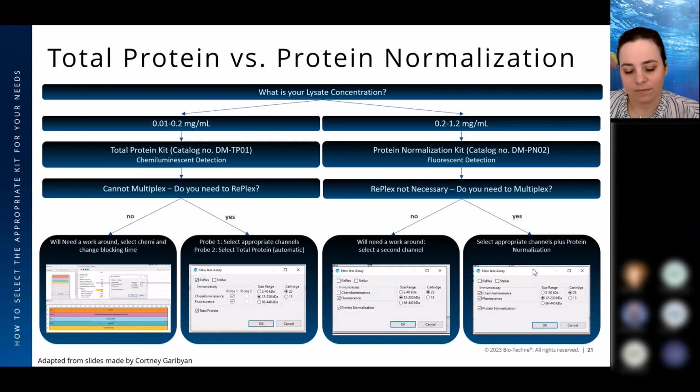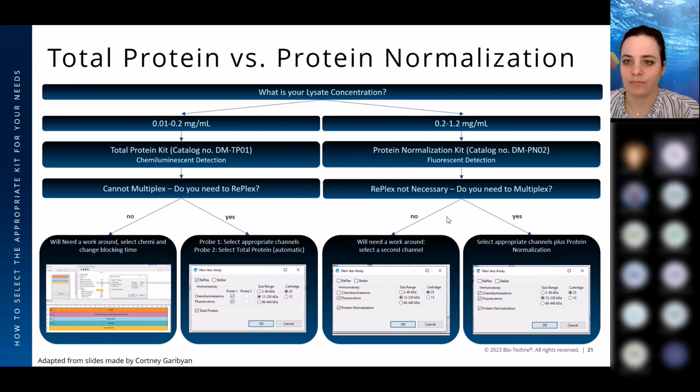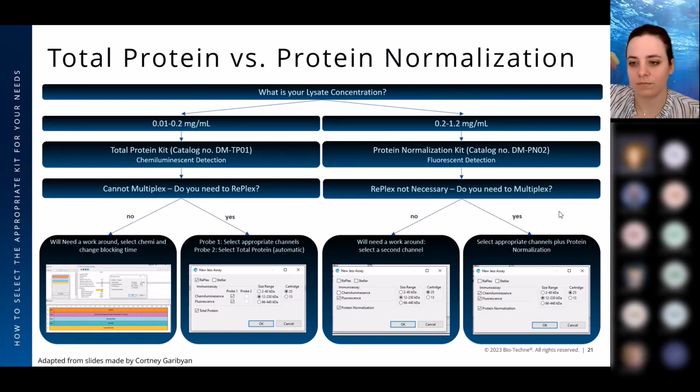Okay, so the temperature is the main factor why we should speed up the process, right? Yeah, just don't bring it out. I would recommend, just don't take it out until you're ready to run. Oh yeah, those reagents, so after the wash buffer addition, the last stage before spinning down. Yes. Okay, thank you. Before spinning it down.